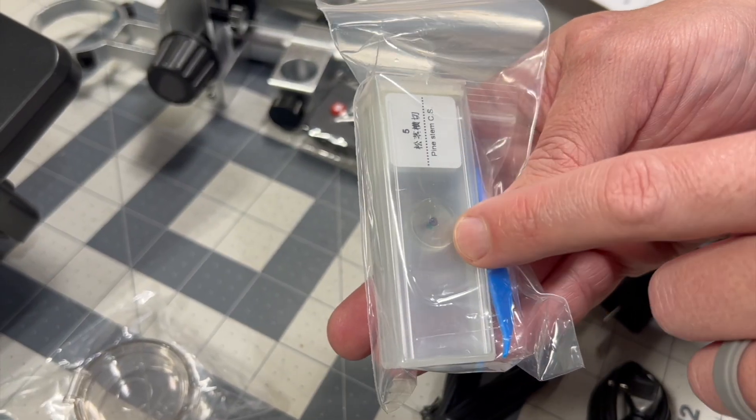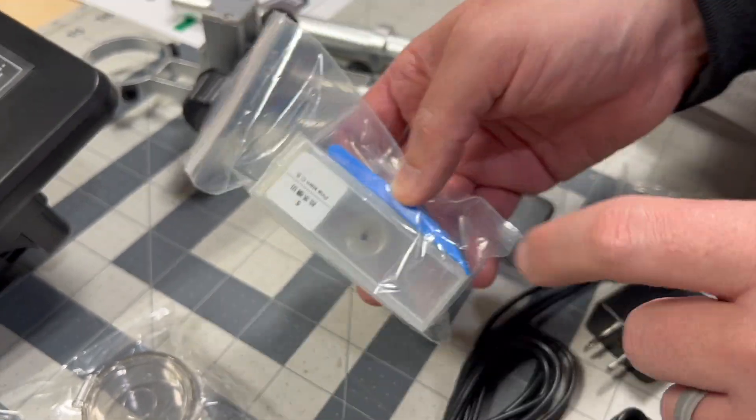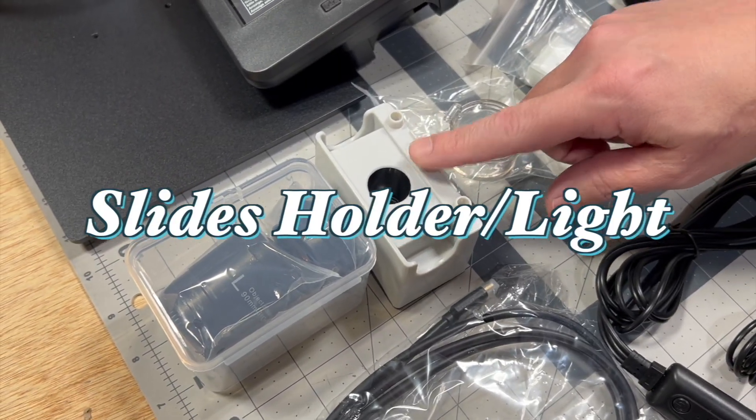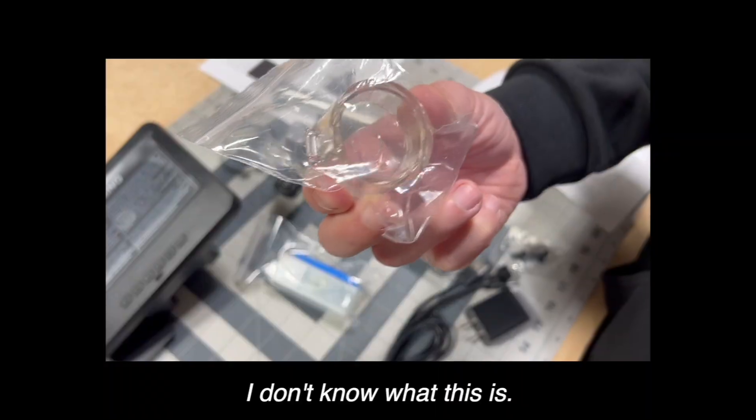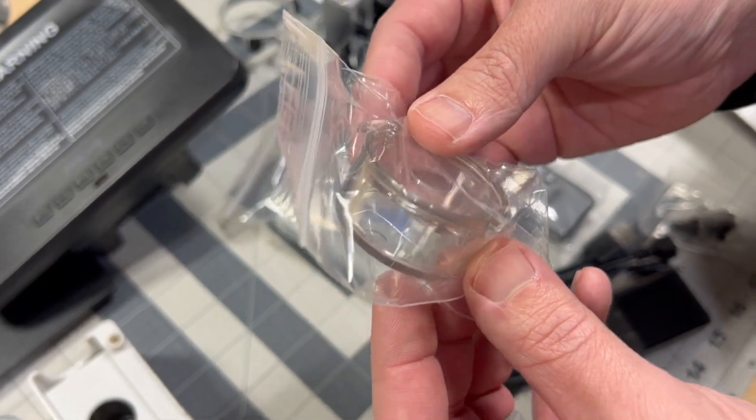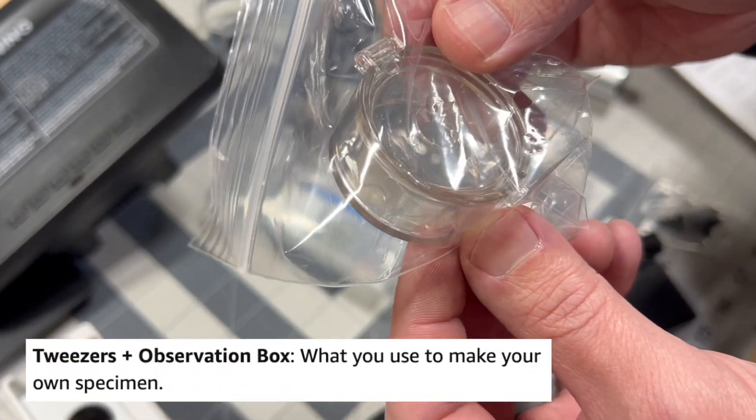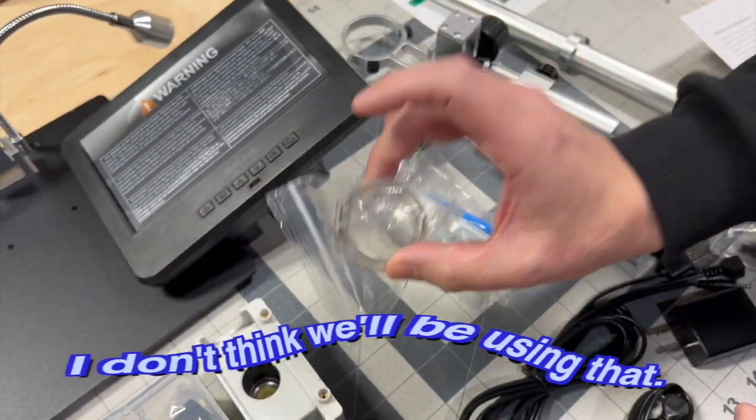And then it actually comes with some sample slides. That's pretty neat. So the top one here is a pine stem. So we can kind of look through the microscope and see what a pine stem looks like up close. A little light box here for slides. You can put your slides on there. It comes with a little bug box. I guess if you put a bug in there and you want to look at it without it crawling away, that's that. I don't think we'll be using that.